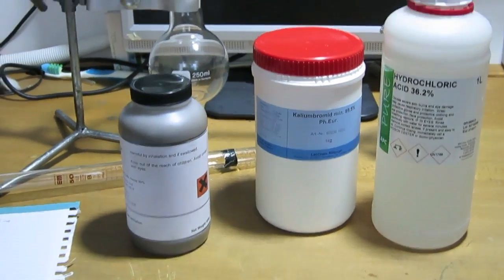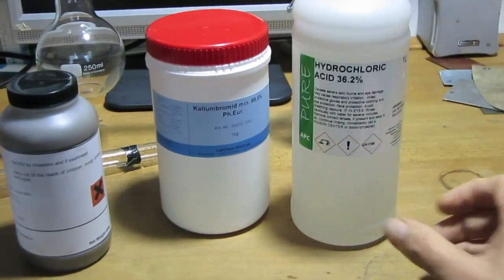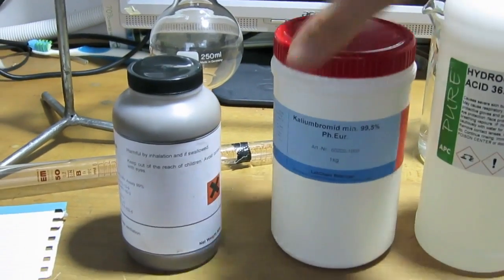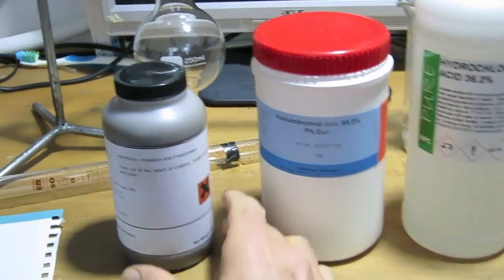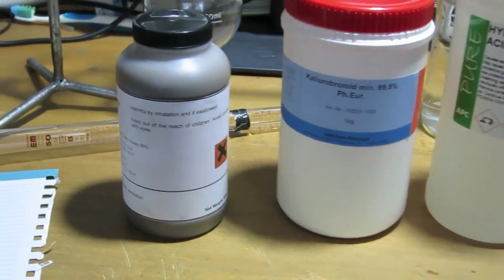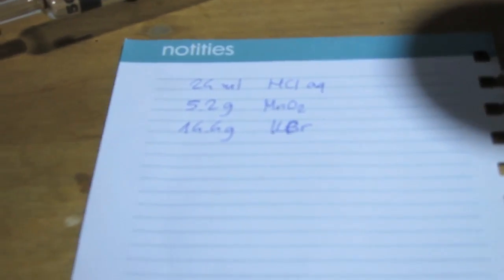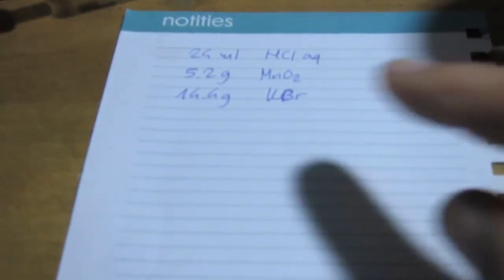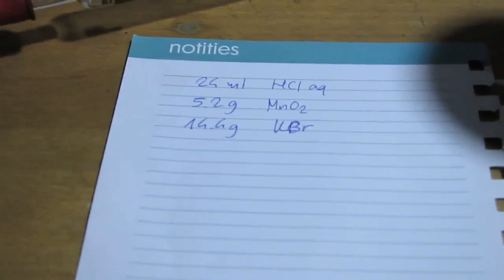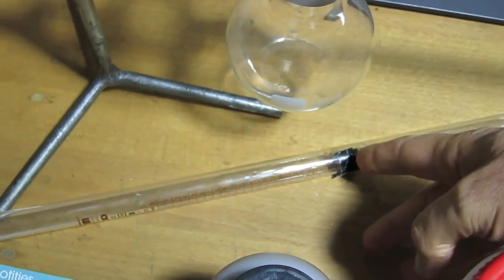I'm making bromine. I require these chemicals: this concentrated hydrochloric acid, this potassium bromide, and this manganese dioxide, MnO2. Potassium bromide, KBr. These are the required chemicals. The amounts I've written down here: 24 milliliters of concentrated hydrochloric acid, 5.2 grams of MnO2, and 14.4 grams of KBr. This is for just counting the hydrochloric acid until this piece of duct tape.